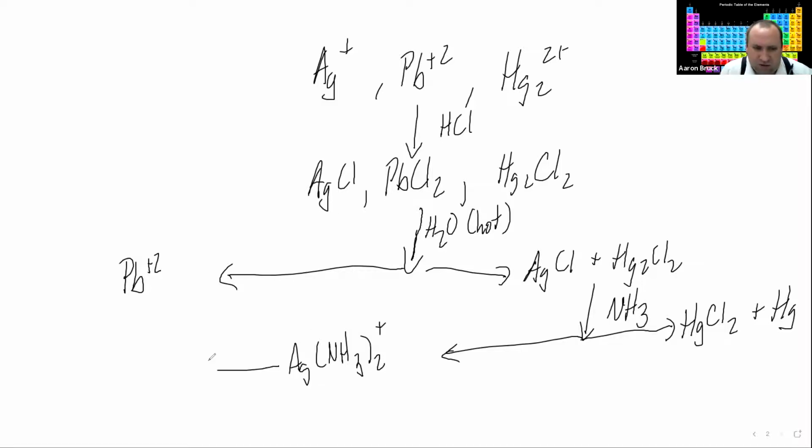We can use something like HCl to get the pH back down to recreate the silver chloride there again. And that's more or less what you're going to do in this procedure. The main point of the first day of the procedure is to go through this process and to just see, okay, this is what happens when I do this. This is what happens when I do that. These are the kinds of reactions that are going to take place.